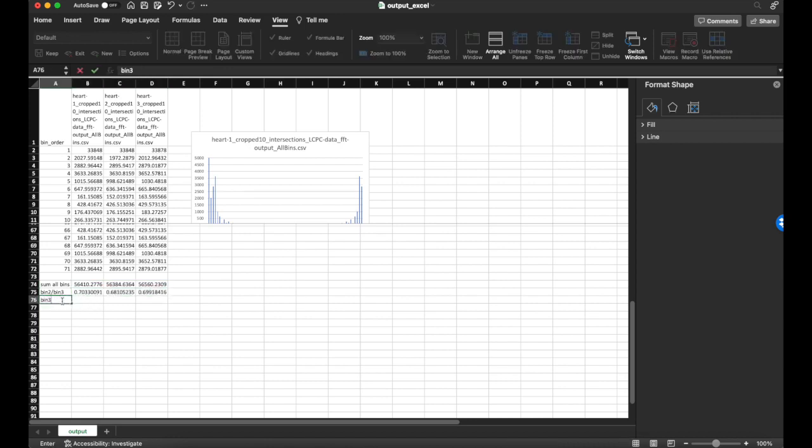You can do the same for bin 3 over bin 2. It's very similar. I first click on the cell where I want to calculate, press equal, find bin 3 and click that, press /, then find bin 2, click it, and hit return. I double click on this equation, and it tells me this is what I am calculating. This is the range here, blue over red, which is what I want, 3 over 2. I press escape to get out, click this bottom right hand corner, drag to the right, let go, and now I've calculated the same thing for all 3 samples.